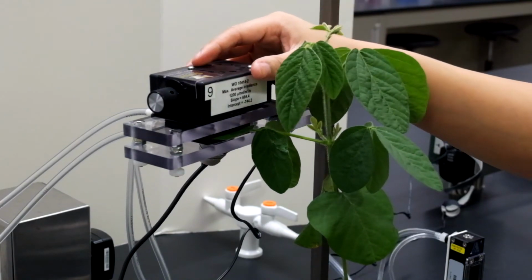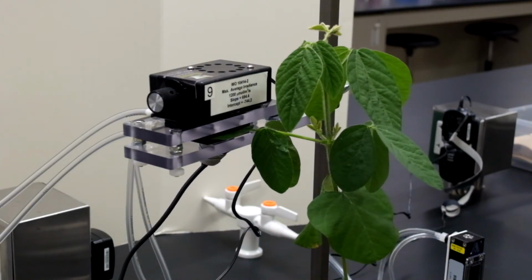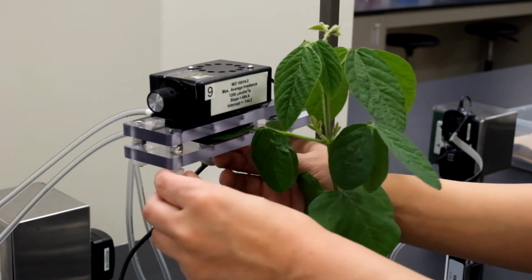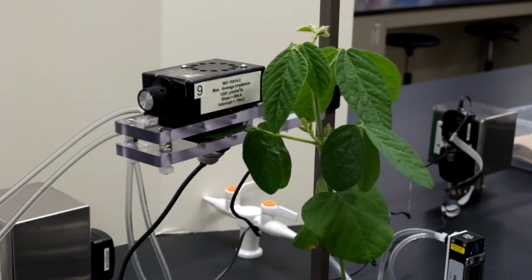Once all 3 screws are in place and tightened so that there are no air leaks, we want to make sure that there are no air leaks, so we do a blow test. And that is by blowing air around the chamber, just using our mouths. On the computer screen, we would watch the graph and see if there is a spike in the CO2. If there is a spike, that means we have an air leak, and we must make sure that the chamber is properly sealed, either by applying more grease or double checking the screws and the tightening.